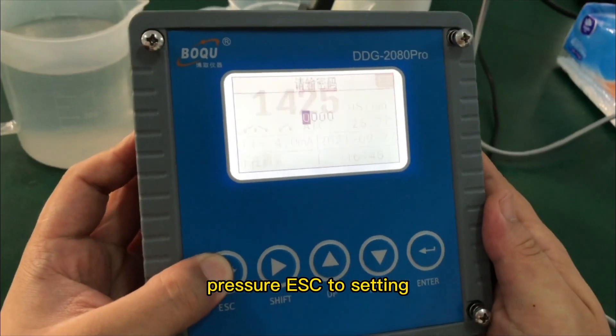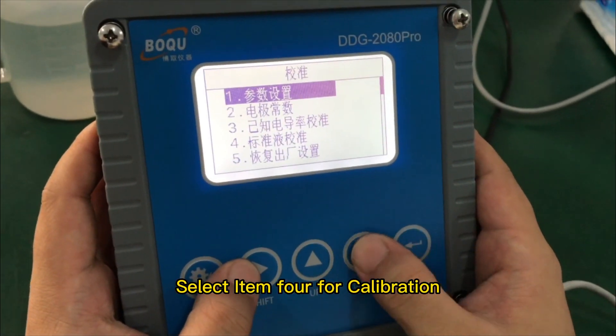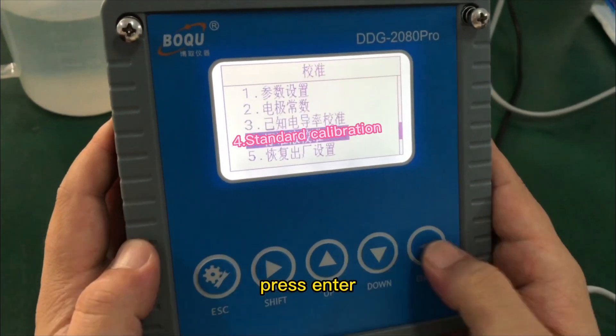Press ESC to go to settings. The password is 3900. Press Enter. Select item 4 for calibration and press Enter.